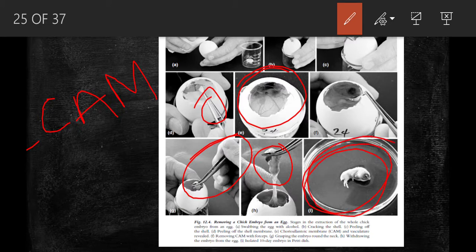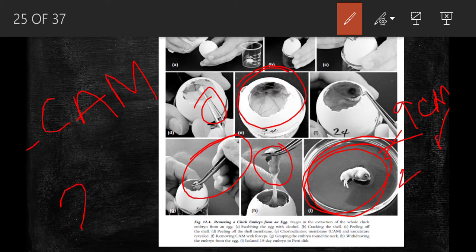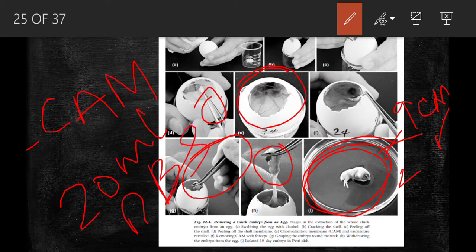Once you get the whole embryo, gently transfer it into a 9 centimeter petri dish which contains 20 ml of DBSS medium. This is how you isolate a chick embryo.